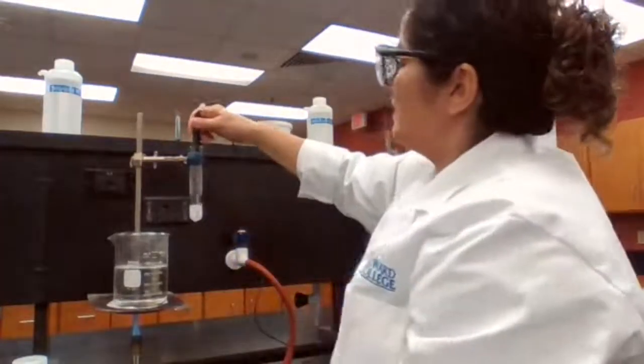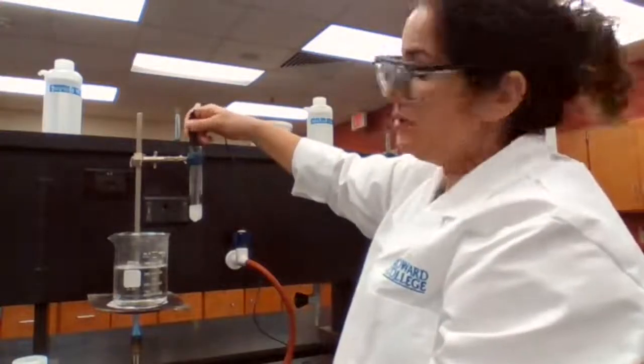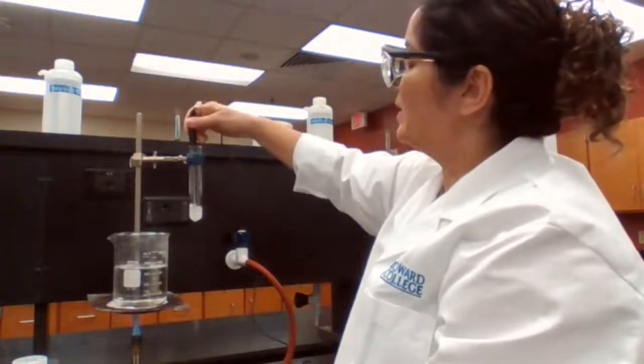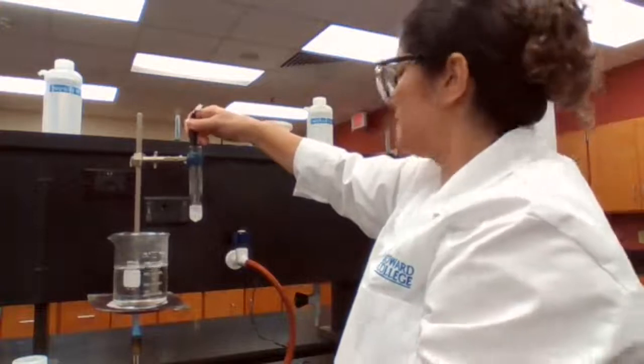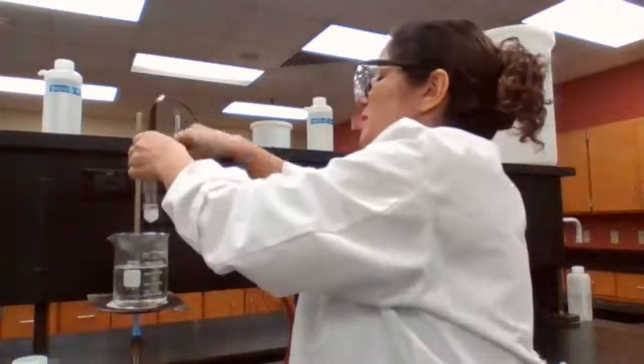So when we add the solute, freezing point will be depressed. So basically it's going to freeze at a lower temperature. I don't want to increase it too high because then I have to spend time to get it lower.